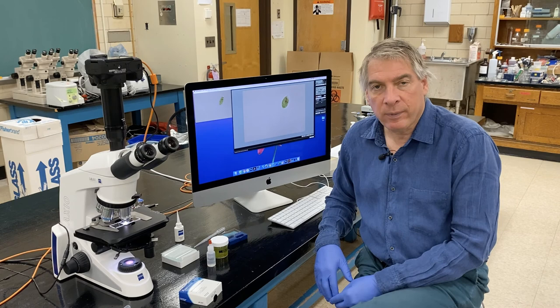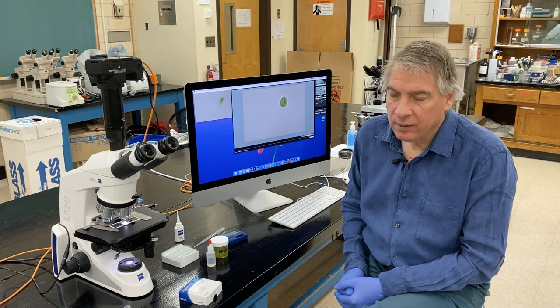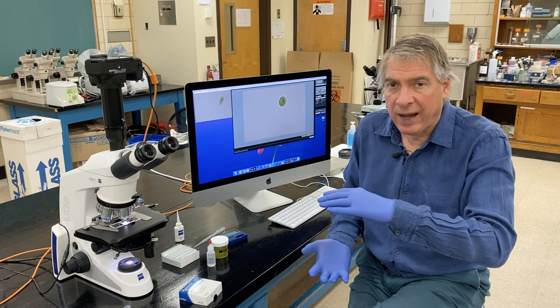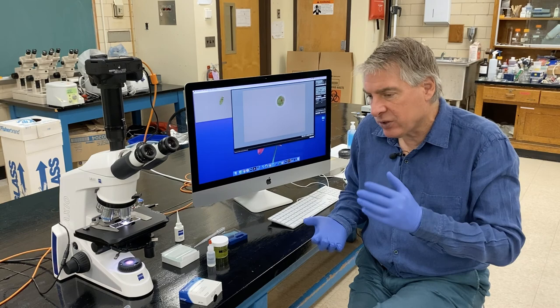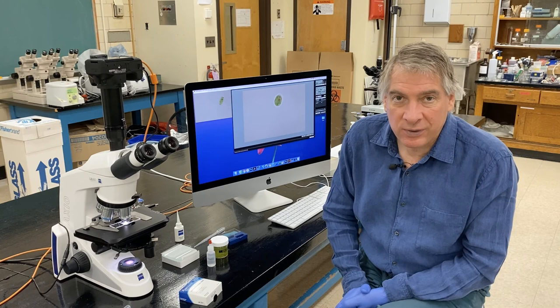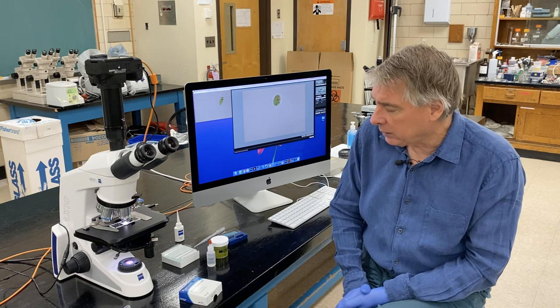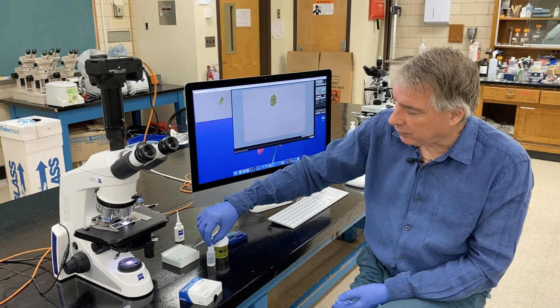Okay, today we talked a little bit about depth of field, which is the portion of the image that's in focus. And it turns out depth of field decreases as you increase the magnification. So something that might be fully in focus, the entire critter in focus at 5x, at 100x, or maybe even at 40 or 20x, parts of the organism are in focus and parts of it are out of focus, and then you have to select what objects in the image you want to have in focus. We were able to take a few videos, so the cameras can take both still images and video images. We looked at protozoans, which are single-celled organisms that make up one of the six kingdoms of life. And we talked a little bit about using Protoslo to slow the critters down.